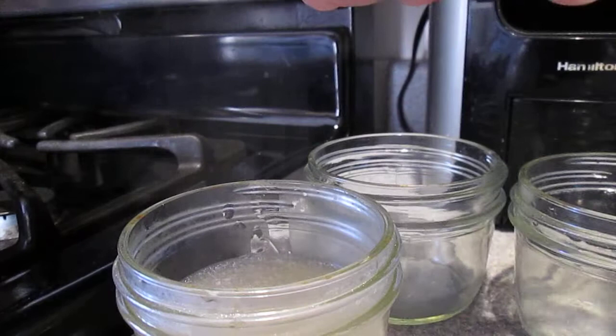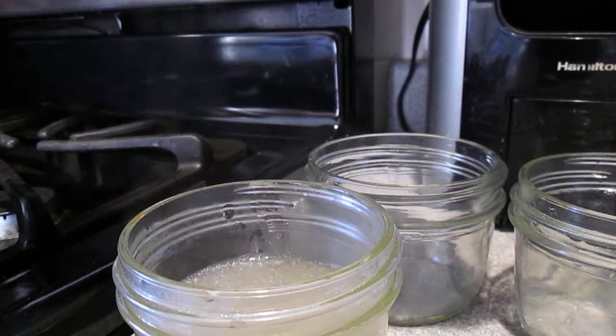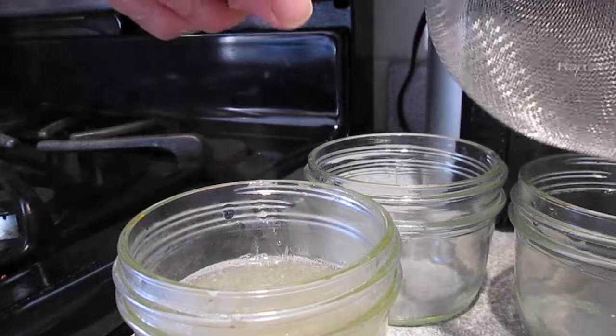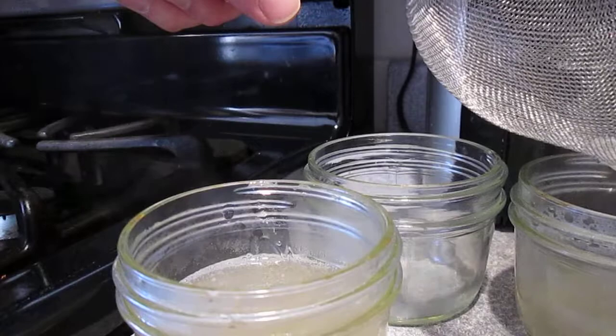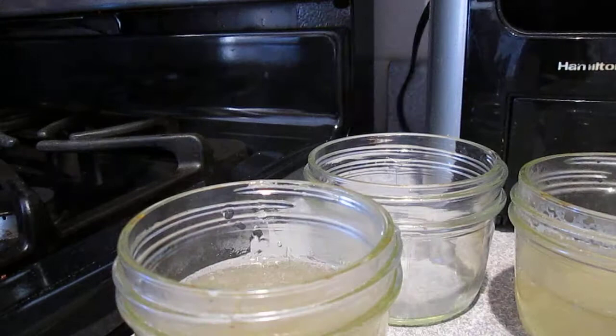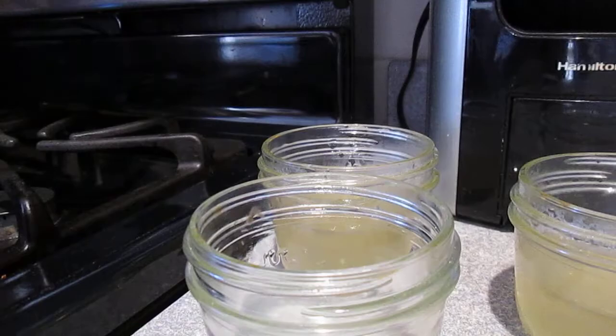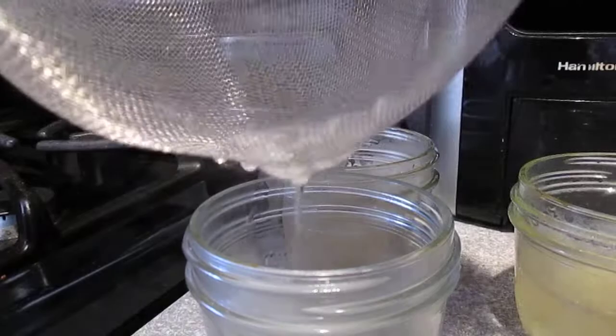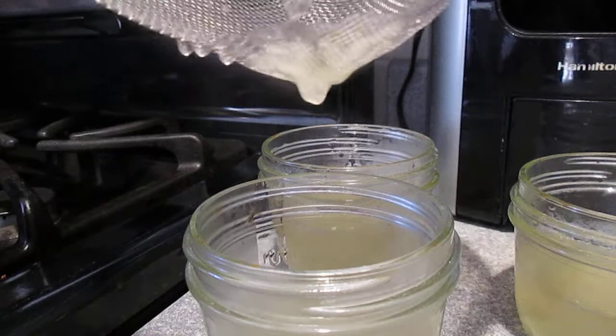I have about four half-pint jars here. As you can see, this strainer caught all the clumps, and it's very important to clean out the strainer right away — otherwise that stuff will never come out of there.